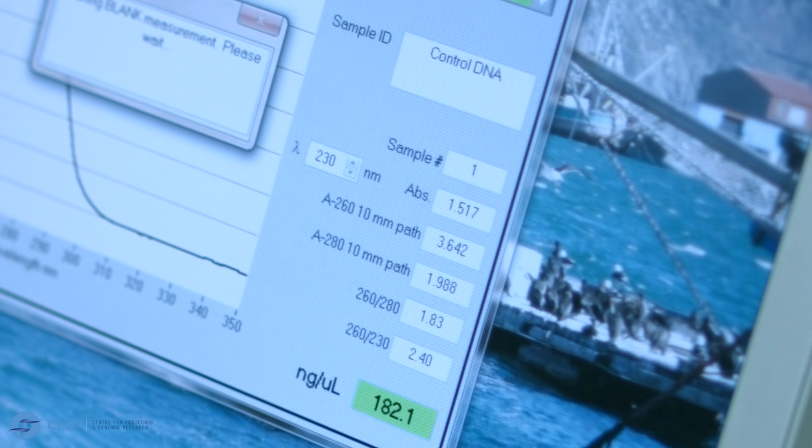As you can see from these results, the samples are all of high molecular weight. This gel picture contains samples that are both of high molecular weight DNA as well as degraded DNA.